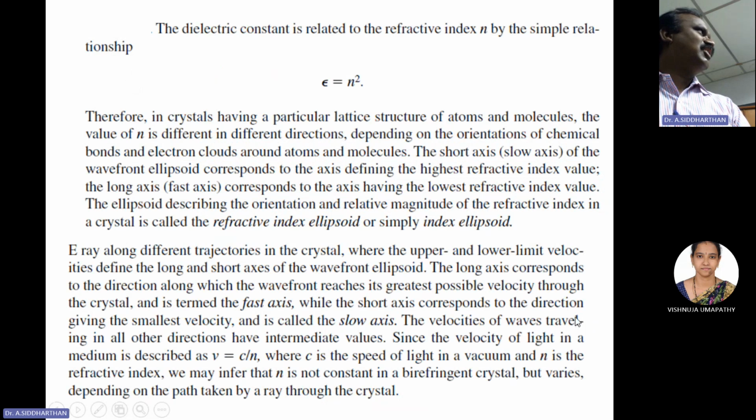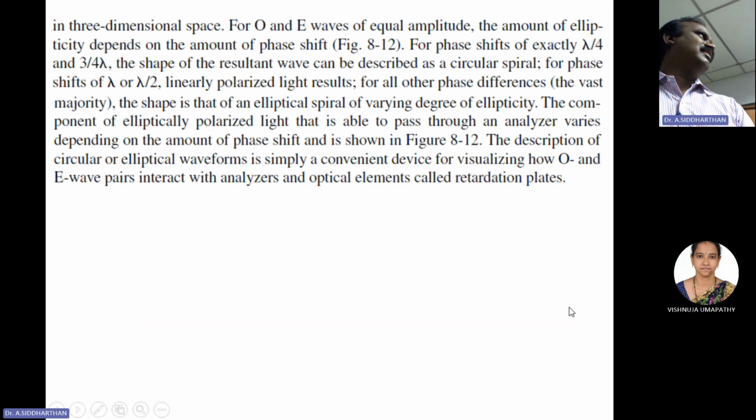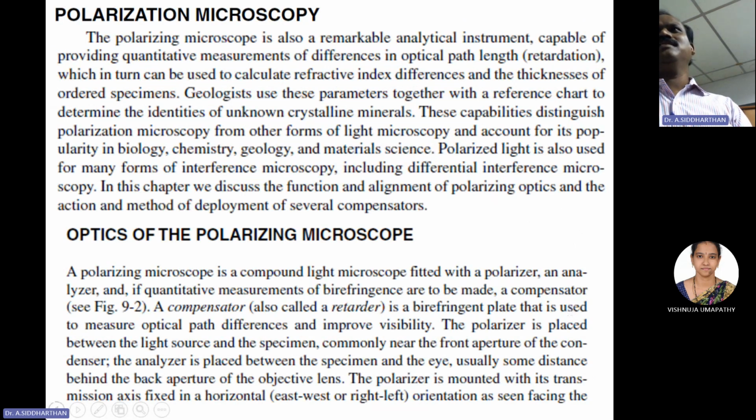If you are using this kind of material, what's the advantage? For anisotropic materials, the contrast can be enhanced by this phenomenon. Later we will see that we can also look at color microstructures. Color is not a characteristic of the material, but I can produce some colors that correspond to changes in intensity, changes in the polarization in the material.